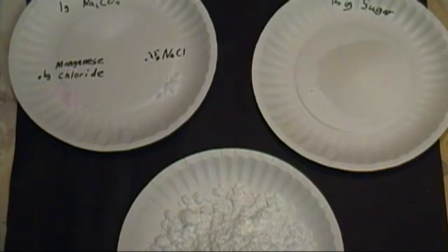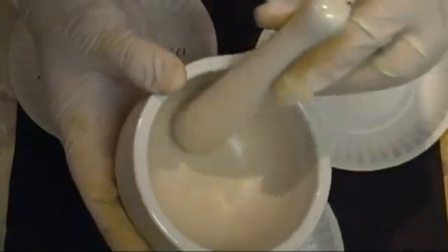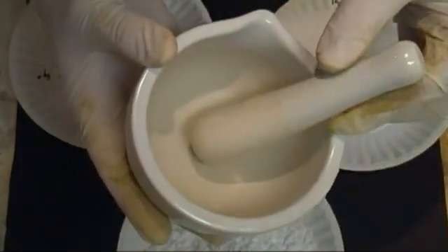You'll also need a mortar and pestle to grind them all together. Place everything but the calcium sulfate in the mortar and grind them together into a powder. The better you grind them together now, the better the end result. All these chemicals must be weighed exactly. It must be very, very pure.